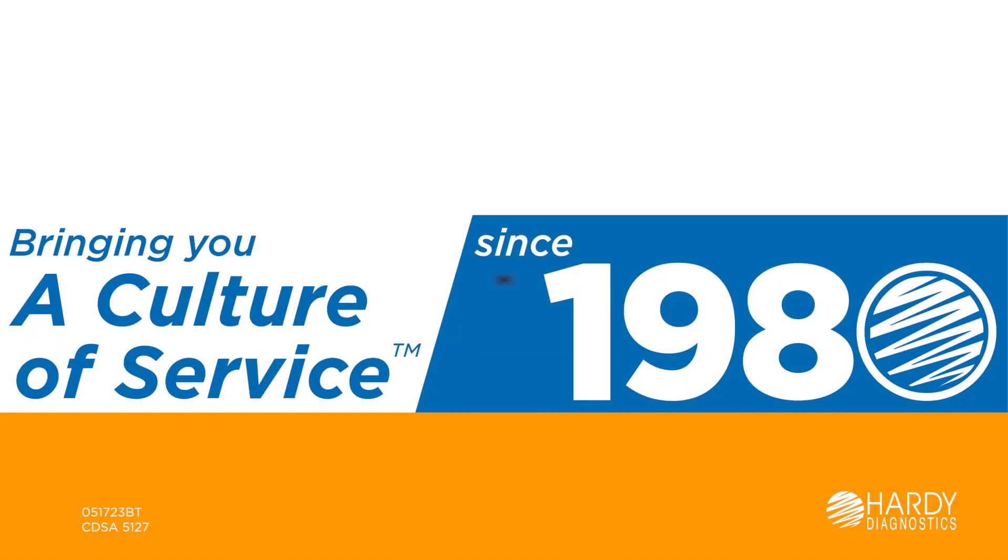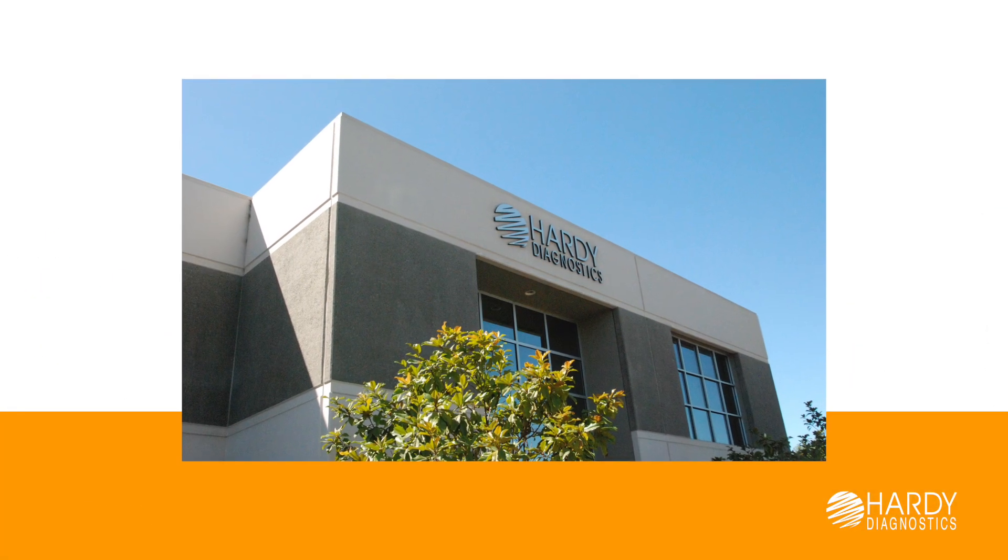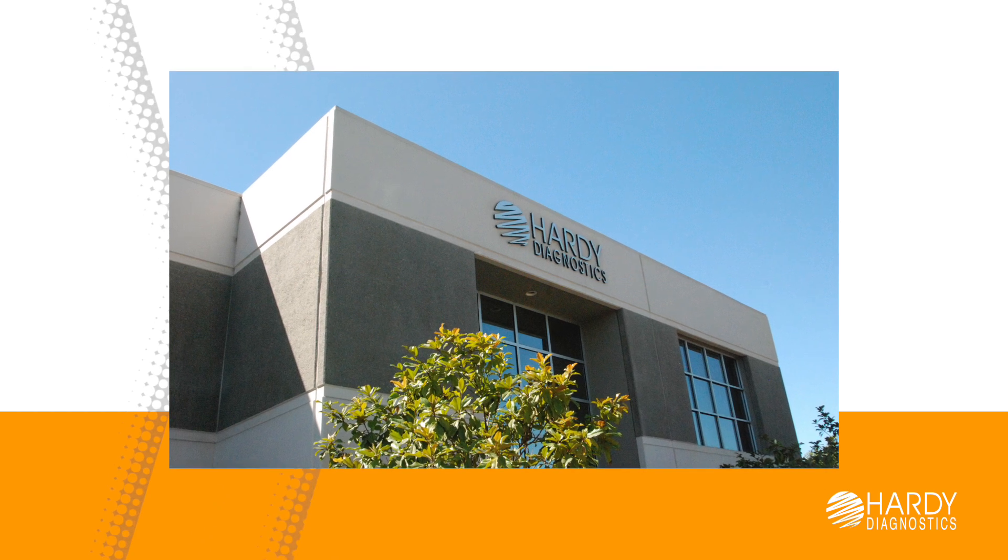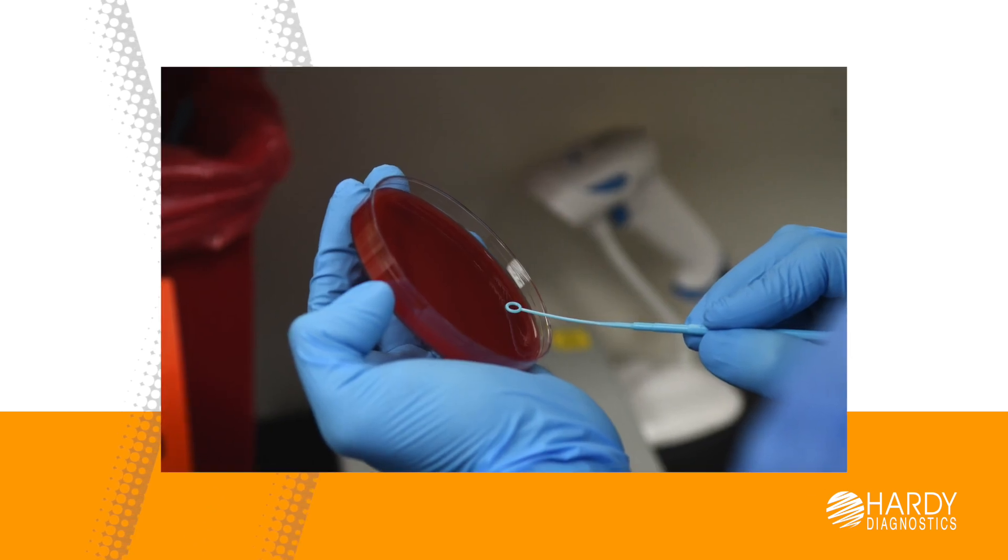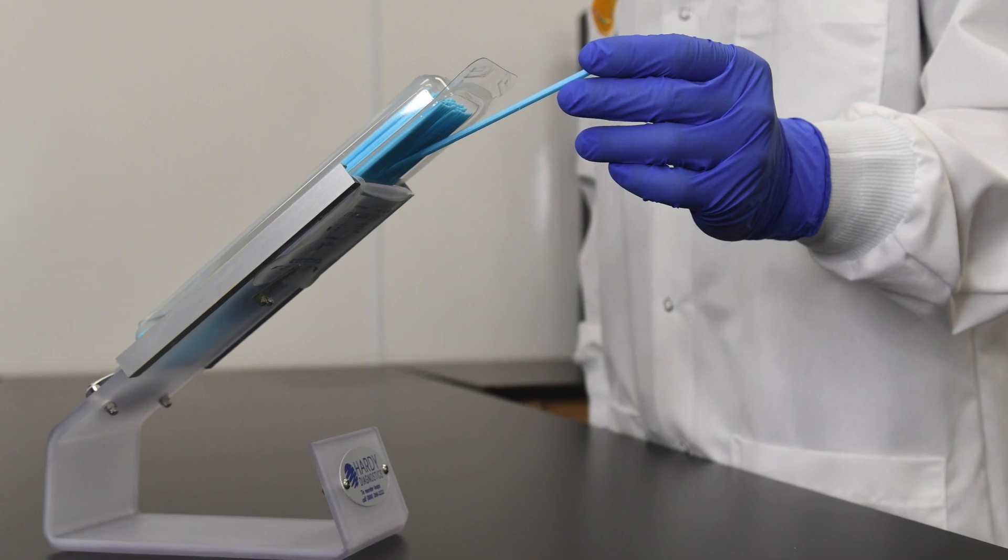For more than 40 years, Hardy Diagnostics has proudly offered our laboratory and microbiology customers convenient and affordable products to assist in the lab. The Hardy Diagnostics Loop Caddy is no different.